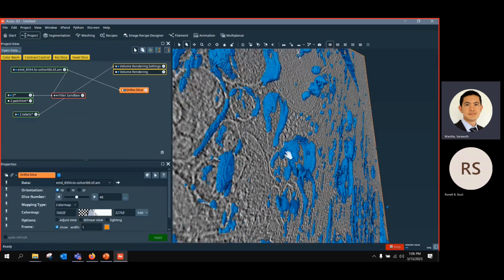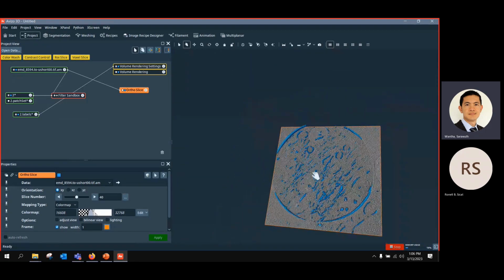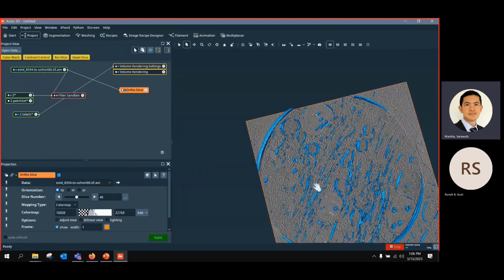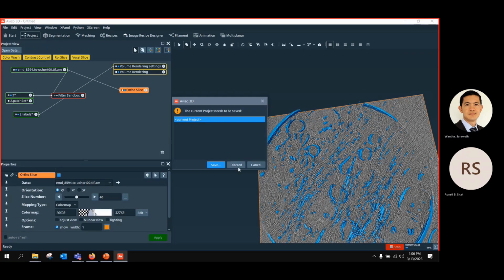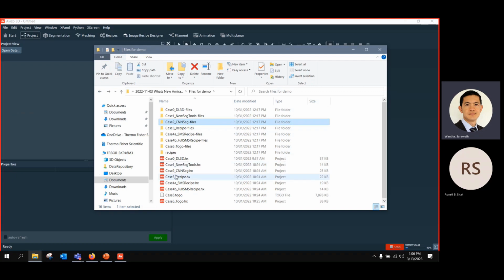If you spend more time and more slices extracting this, you will get a roughly ground truth image for doing the real segmentation with deep learning later. Okay, this is only one structure, the vesicle. I will load the example of the total results. So I go here.